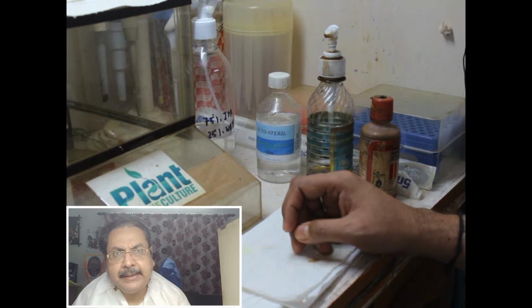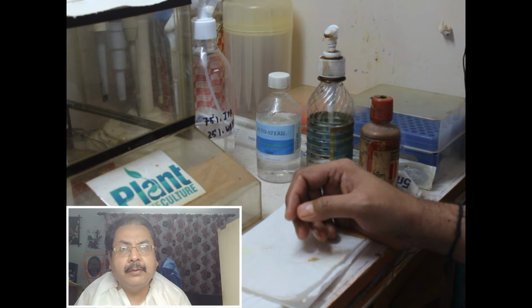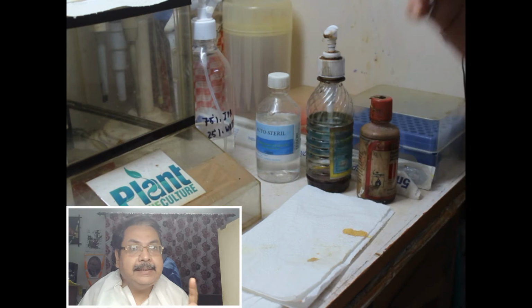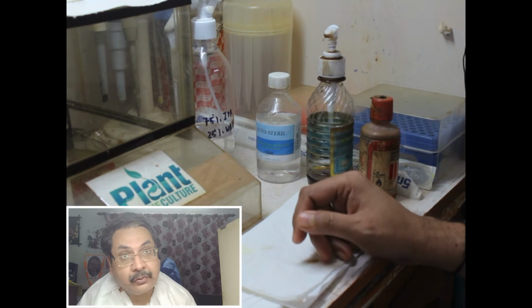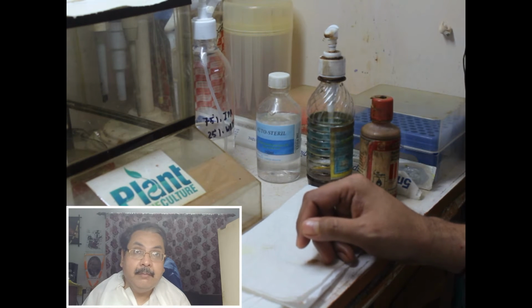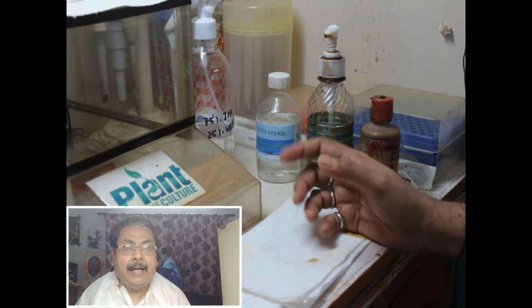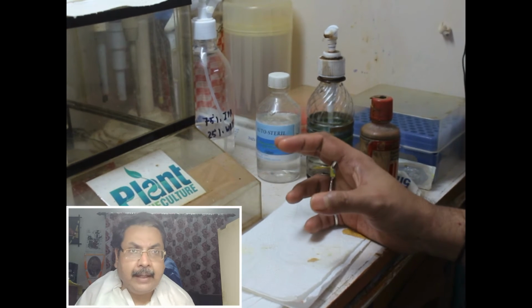You can purchase that, and it will cost you around 4,000 or 5,000 rupees. Generally, this TDS meter and this pH meter are sometimes combined, and that is also available. That is also a very good one, but you have to purchase from a reputed place. Don't purchase from any unknown or unreliable company.